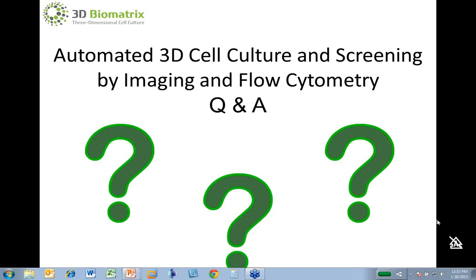Okay, for the next question, I'm going to address to Nikki, and it concerns the use of PVA to help form spheroids or other extracellular matrix. One of the questions was, is the polyvinyl alcohol toxic to the cells? And another question was, how do I know how much to add?